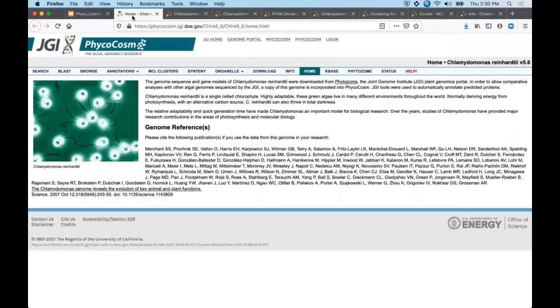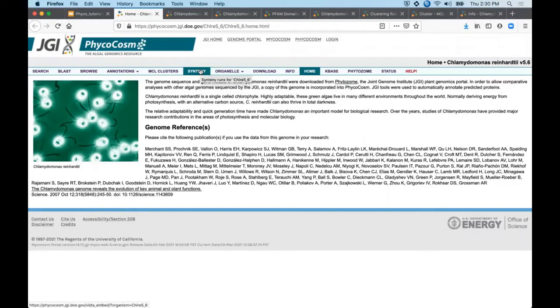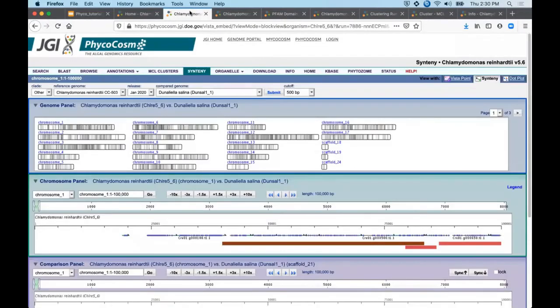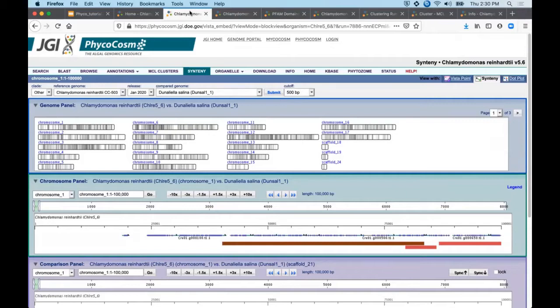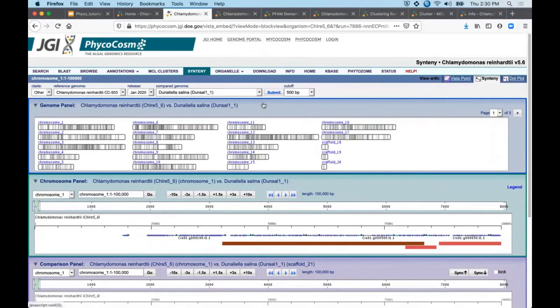Beginning from the homepage of the individual portal devoted to Chlamydomonas reinhardtii, the first tool I will highlight is Synteny, where we can access Vista alignments to compare this genome to another of interest in a whole genome assembly context. These are similar to global alignment results from software like Mummer.